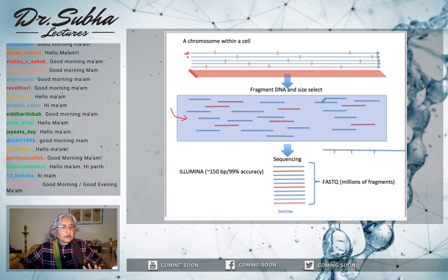Okay, let's not worry about the reverse strand, because the reverse strand is nothing but like the forward strand, right? If you are given a reverse strand, would you be able to compute the reverse complement? You can always do that, correct? But when you're sequencing it, at the read level, you don't even know where the fragments are coming from. Are they coming from the reverse strand, or from the forward strand? You wouldn't know. It will all be sitting in a FASTQ file like this.